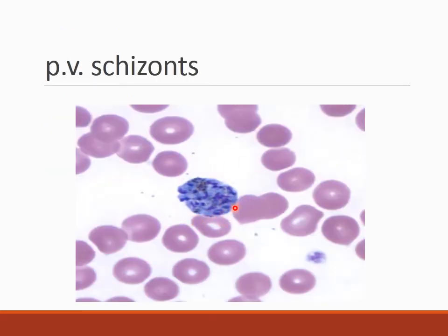This is a schizont with the presence of Schüffner's dots.